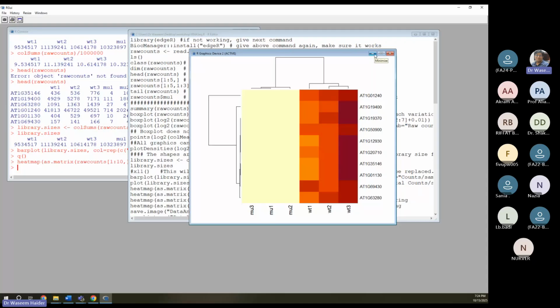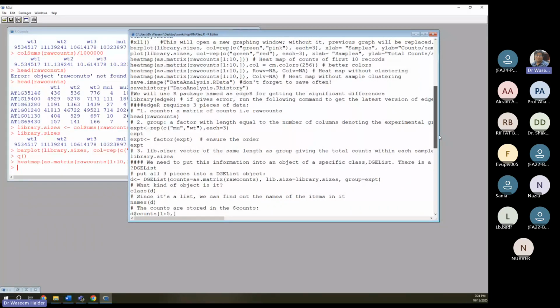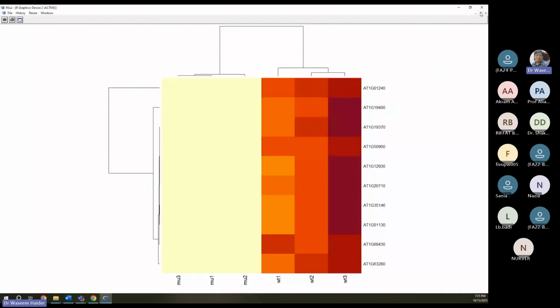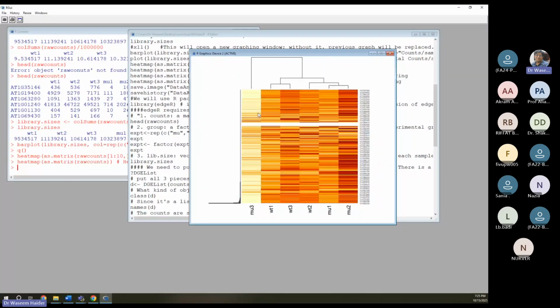Okay. All right. So what if I don't go for only, by the way, I took heat map for the top 10 genes. So what I can do is remove that part and get the whole pattern. It will take some time, but let's give it some time. So it's replacing this picture. It's running, so that picture will be changed as soon as it's done. Up till now, if you have any questions or queries, you may ask. We have 1 hour, and I think I will be able to end this DGE part in a moment.